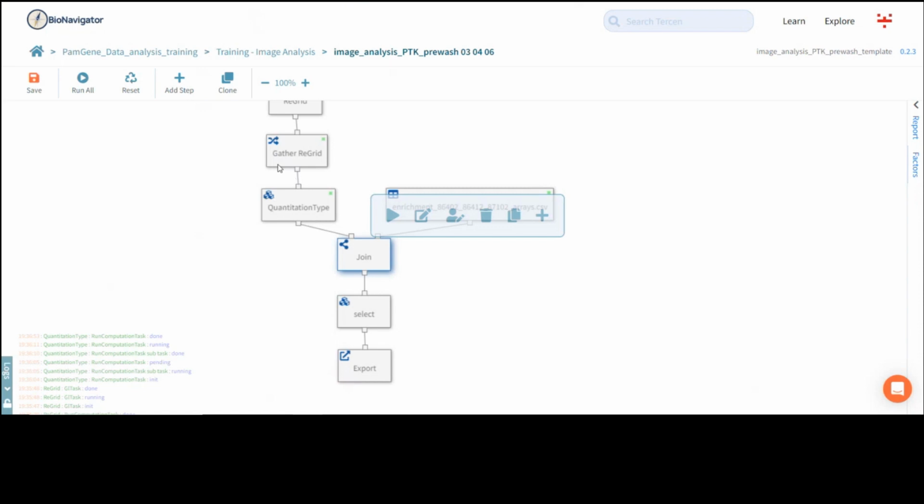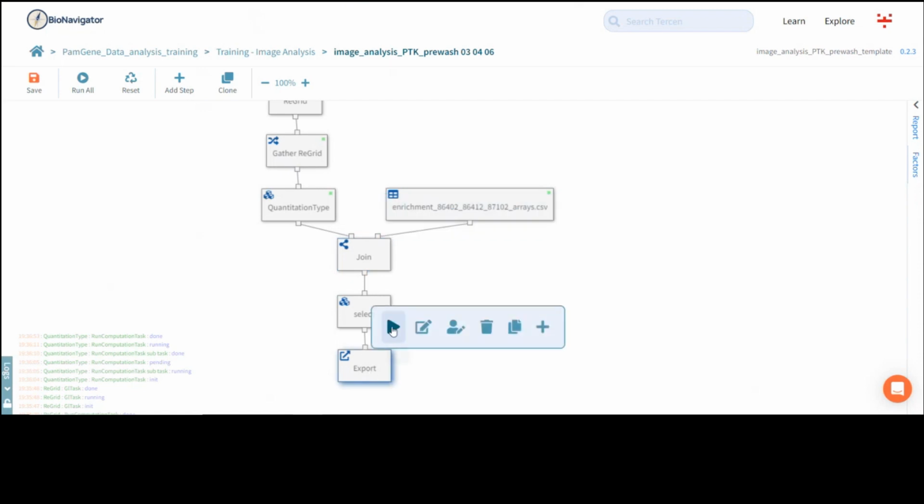At the end, you click on the export button. If everything goes well in the image analysis, this is all you have to do. One last thing, never forget to save your workflow. If the save button is orange, click on it. Otherwise, you will lose your progress if you accidentally close the whole page. Actually, the best is to save it during running as well, multiple times.